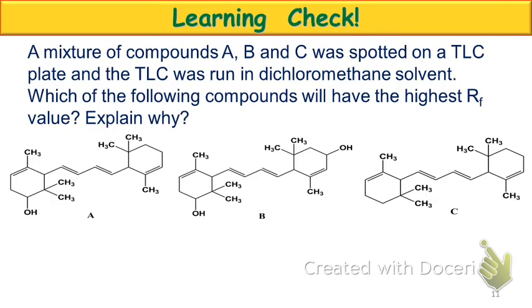While she's doing that, we'll go ahead and answer these questions. We've got these three compounds, A, B, and C on TLC. What's the first thing that you should do to answer this question? I would go even further back than just trying to figure out most polar. The question asks you highest RF.